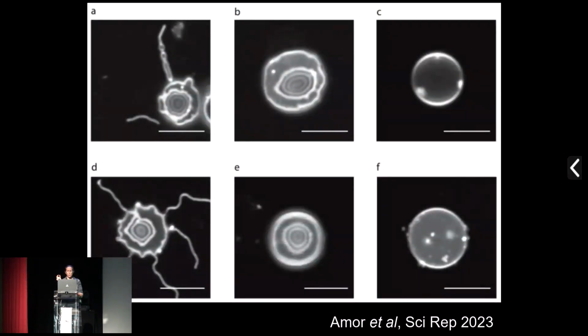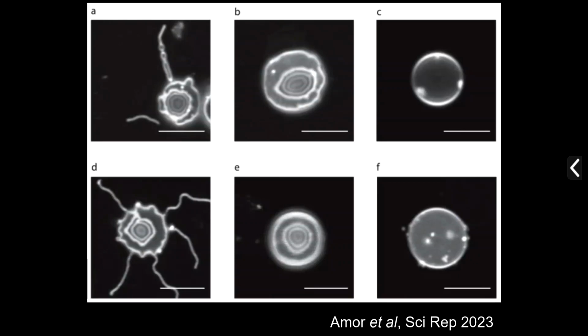And we've done this at the micro scale, just to show you what red blood cells look like. They've got a kind of curvature of the membrane. This is a healthy red cell here, where you can see that as the contour lines come up, you're coming up in the basal membrane. This is not a happy red cell. You can see these projections. These are not visible when we don't use interferometric imaging.